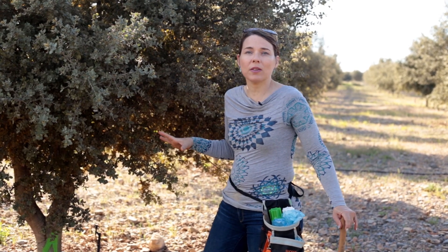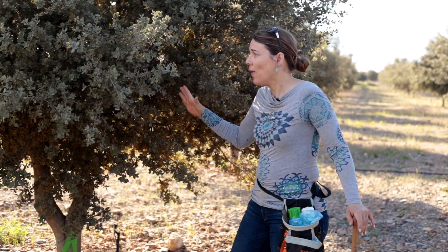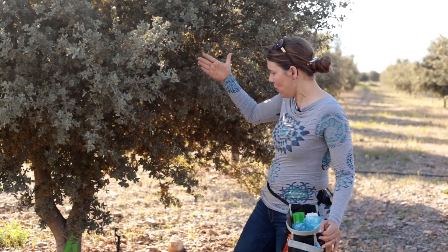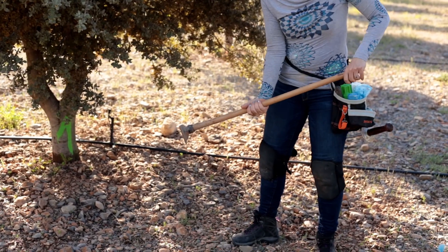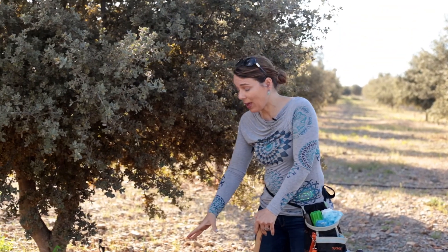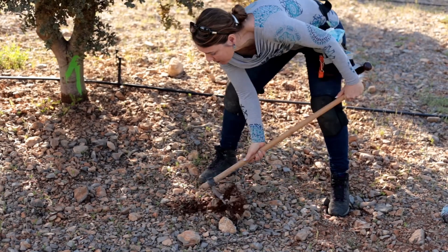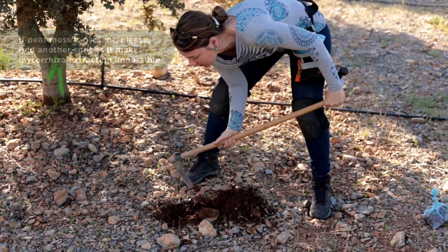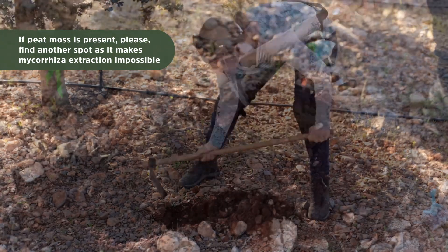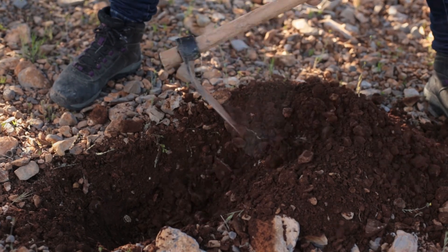Now we're going to look for fine roots — thin roots are the ones that have the mycorrhiza, and those are the ones I need for the lab to analyze and understand what mycorrhizas are in your trees. We normally start more or less where the crown finishes. We'll start digging there and go down until we find the fine roots, then collect them.